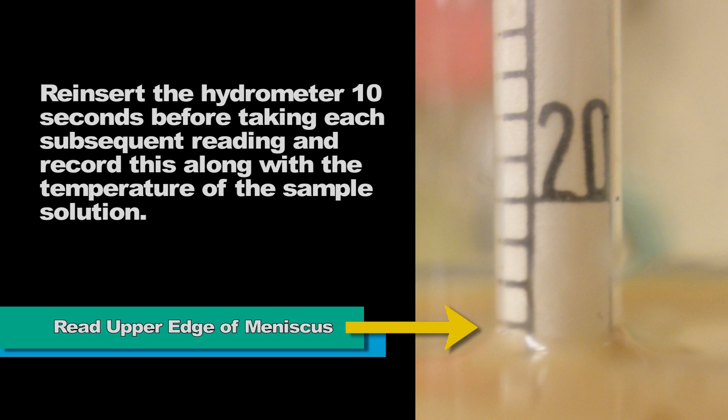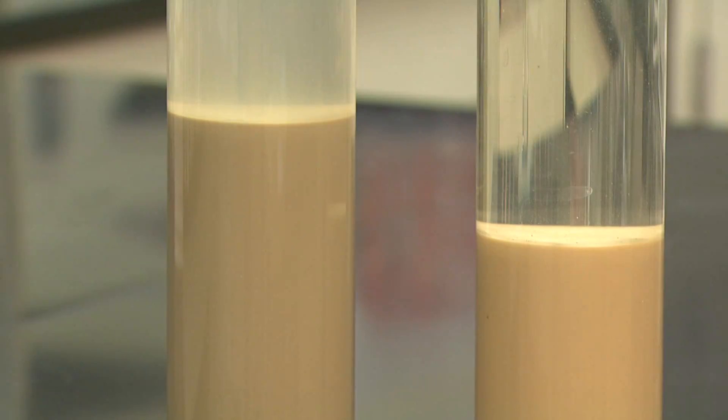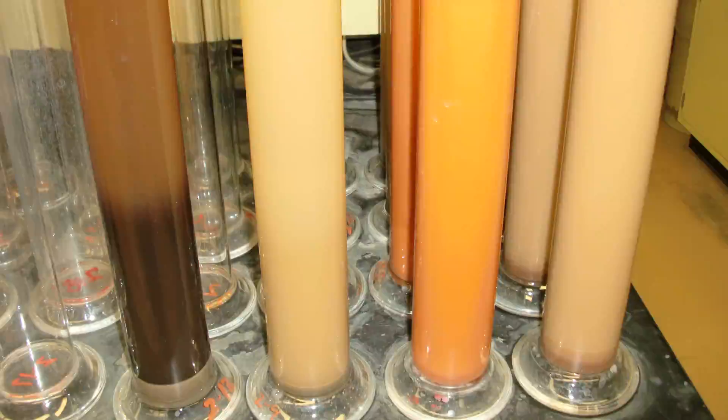Remember to do the same for the blank. When a sample is high in soluble salts, flocculation will often result. As can be seen, particles will settle unnaturally in solution, sometimes with distinct dense and clear layers. Should this occur, results obtained by the hydrometer method will not be accurate and the sample should be reanalyzed by a method in which soluble salts are removed.